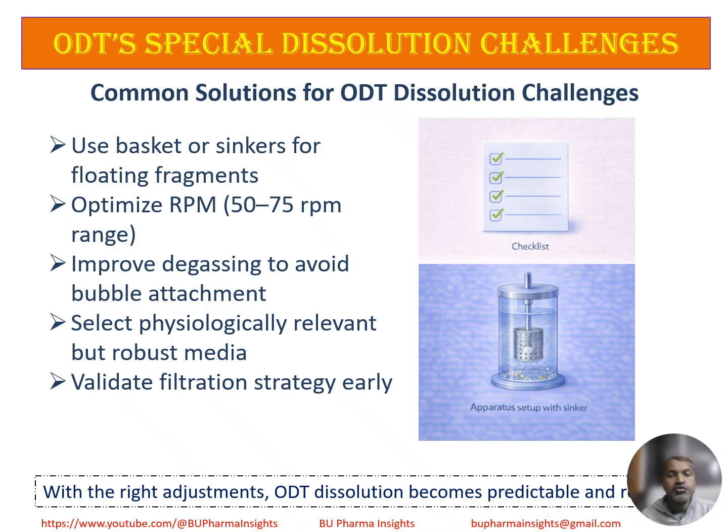Improve degassing to avoid bubble attachment. Select physiologically relevant but robust media. Validate filtration early. Never guess, always observe. Real-time visual monitoring is the fastest way to diagnose problems and design a reliable method.